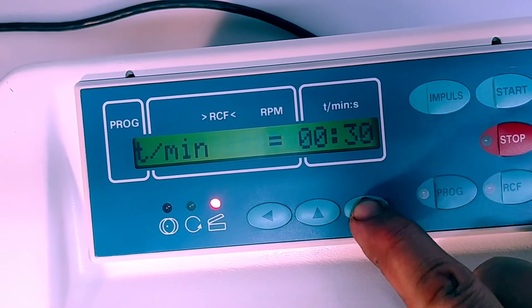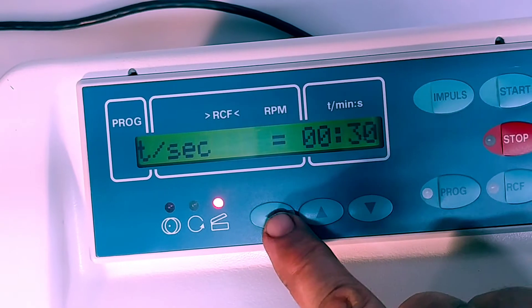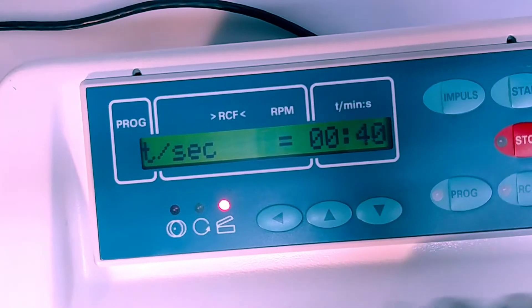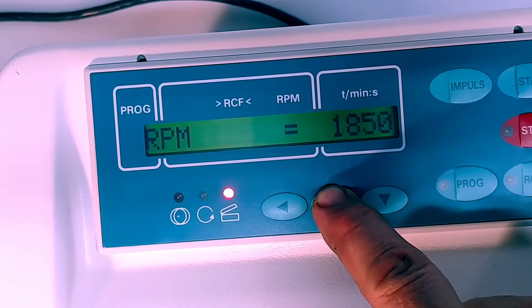Taking a quick look at the controls, we'll go in and set the time. We'll bring the time down — let's say one minute, actually we'll bring it down to 30 seconds, then let's bring it up to 40 seconds. Okay.